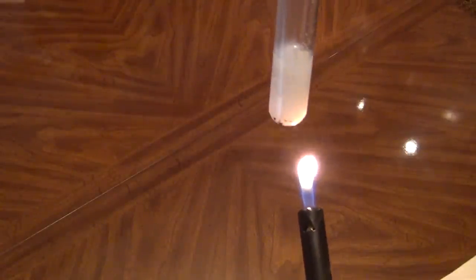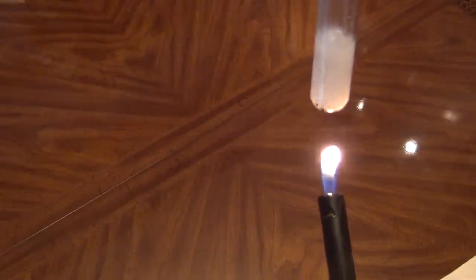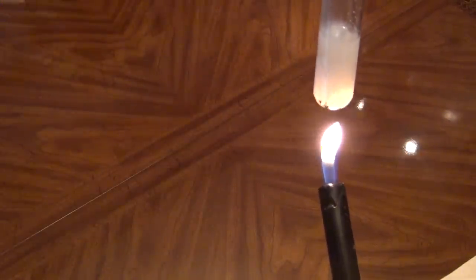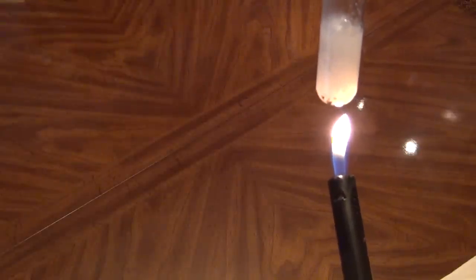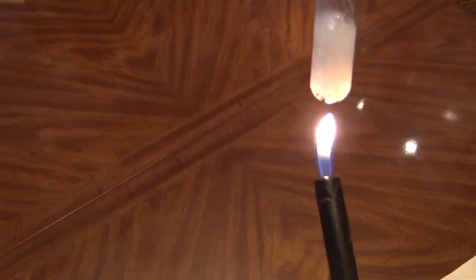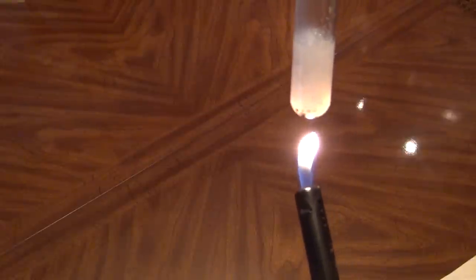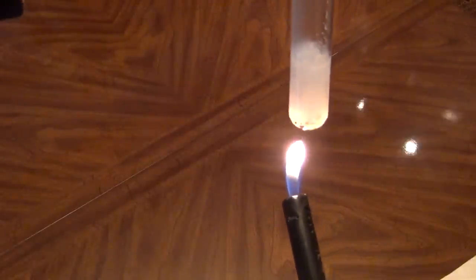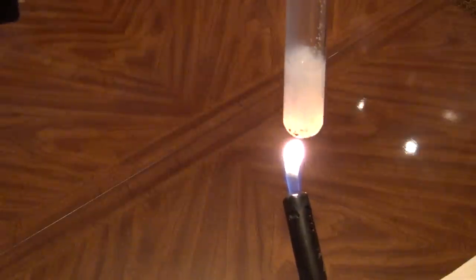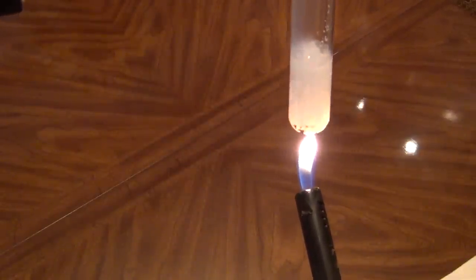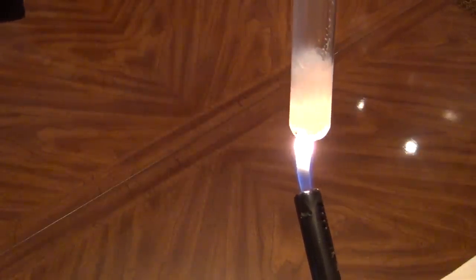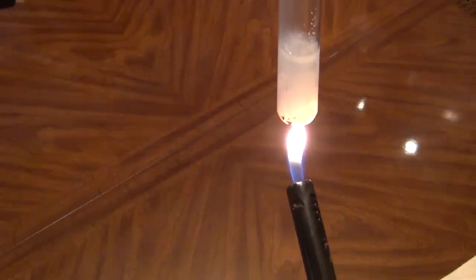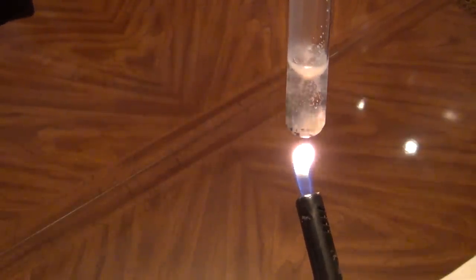See if we heat it up, you'll see it begin to boil here and it'll clear up. There, it's beginning to clear.